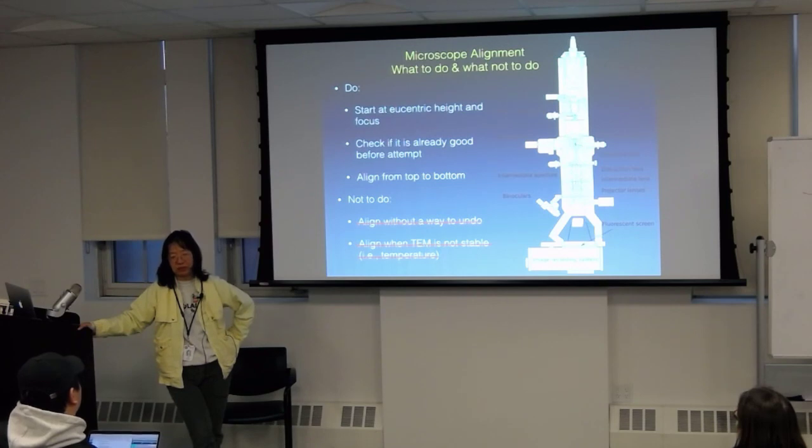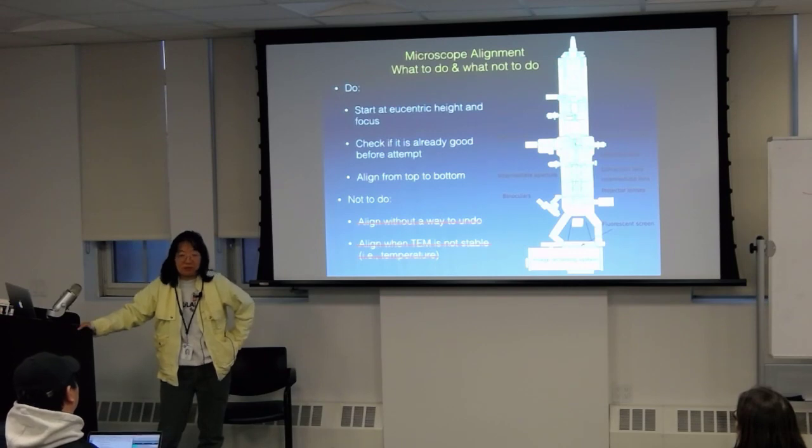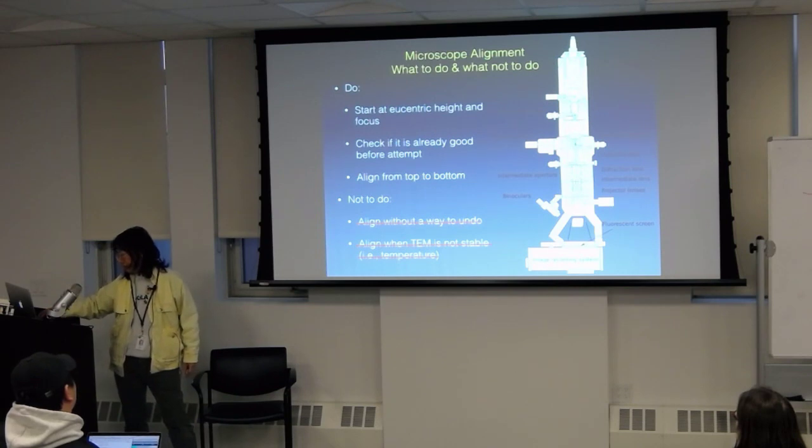It's not whether you are using a cryo specimen today or a negative stain at room temperature. That's not the issue, because most of this is under vacuum. Your lens is not going to know whether your sample is at room temperature or cryo. Anything else?